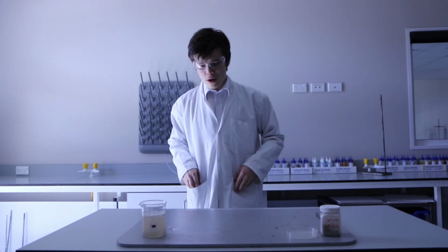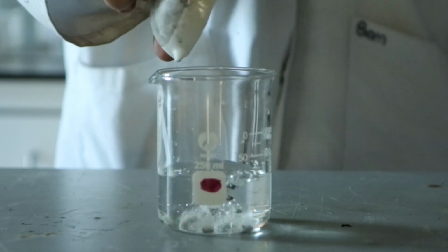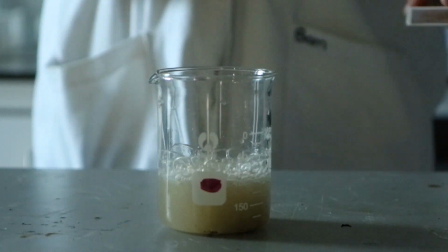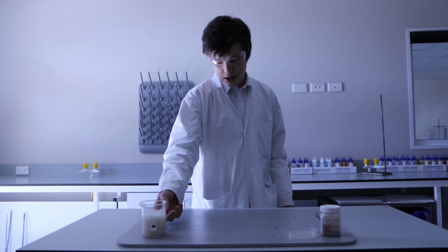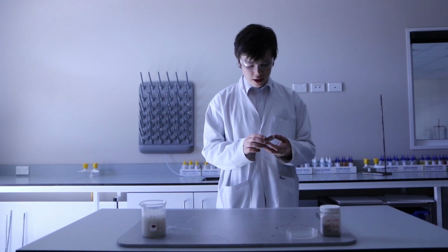Now what's going on at the moment is calcium carbide naturally oxidizes over a long period, but the water here is acting as a catalyst, which is speeding that oxidization up rapidly. As you can see, there's a lot of gas being produced. You can see all the bubbles. That is called acetylene gas.